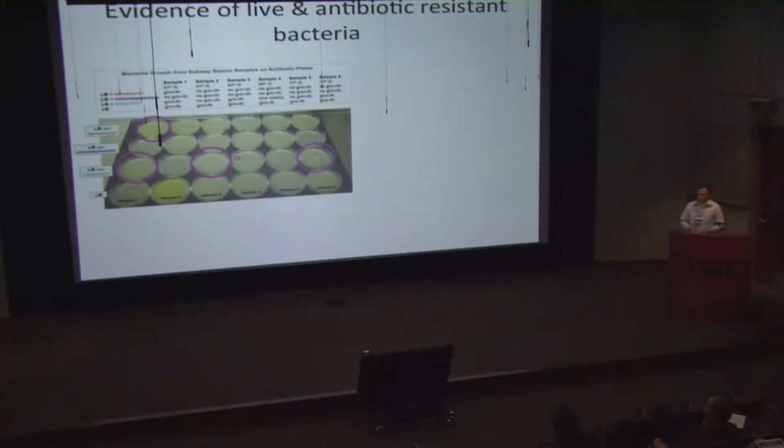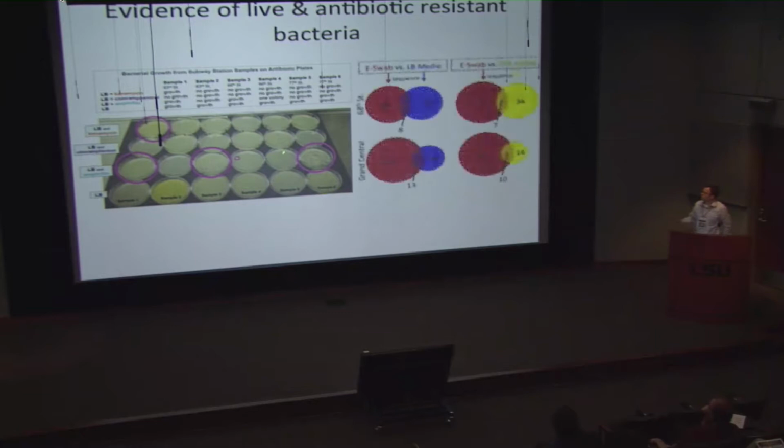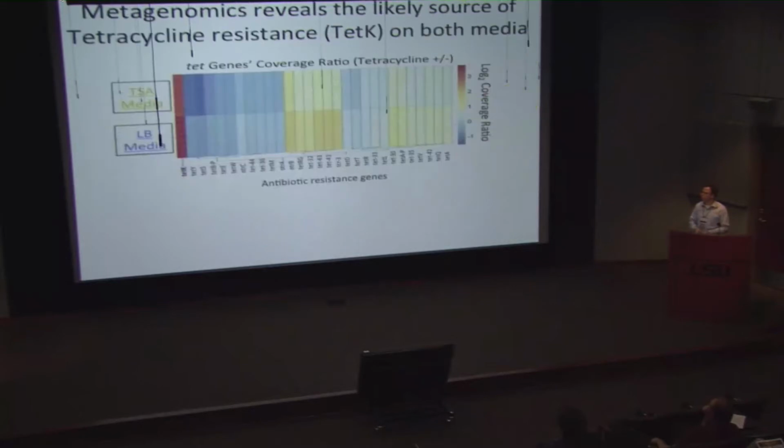The other thing that we looked at in the data was, do we see any evidence of live or antibiotic resistant bacteria? So it's just DNA, but is it actually alive? And the answer is yes: in a lot of cases, about 20% of them, when we tested, we did see antibiotic resistance. But then we took these plates and compared them, and asked, if we culture them here on 2 different media on the right, or just take them and sequence them, what's the overlap of species that we detected? You can see we would find more species by sequencing rather than culturing, because the culture process enriches for only things that will grow on there.